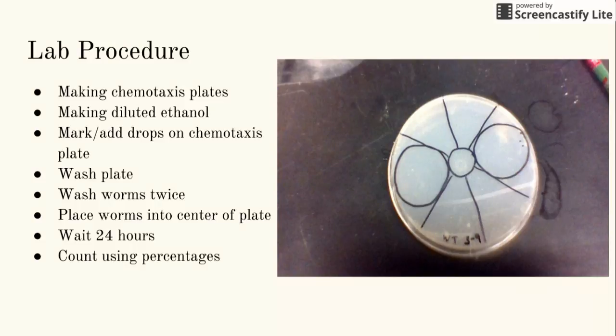Then filling another microtest tube with equal value of water to that of the C. elegans and centrifuging for 40 seconds. In the original procedure we used, cleaning the worms had nothing to say about the excess water that would be in the microtest tube, so we came up with our own method to remove the excess water while not disturbing the worms.